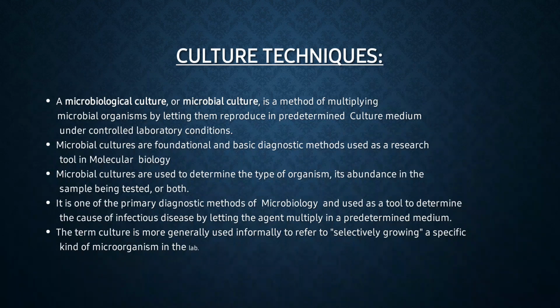Microbial cultures are foundational and basic diagnostic methods used as a research tool in molecular biology. Microbial cultures are used to determine the type of organism and its abundance in the sample being tested. The term culture is more generally used informally to refer to selectively growing a specific kind of microorganism in the lab.